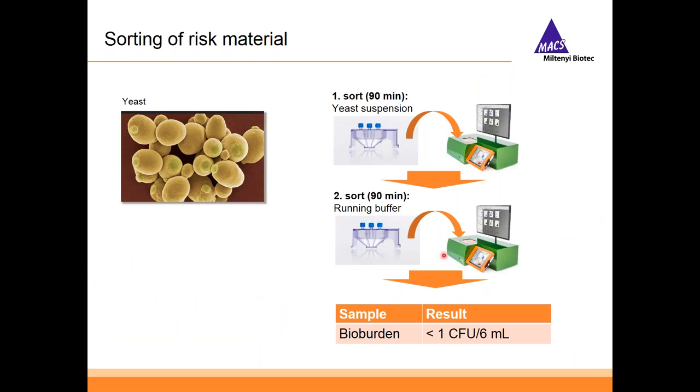So the test was the following. First, we sorted a yeast suspension in the Tyto, sorting for 90 minutes. Then after the sort was finished, we took out this cartridge and put in another one directly, only containing running buffer, that's it. And then we simply ran the running buffer for 90 minutes.